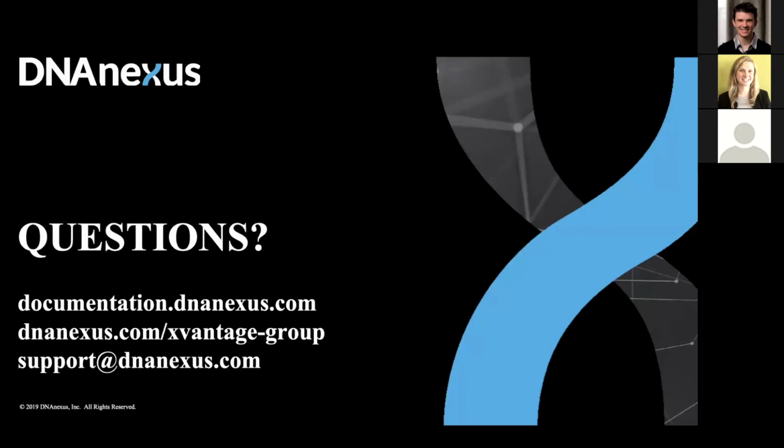Great question. So DNAnexus provides, or we provide you with the command line API. You can install that on either a Linux system or a Windows system or a Mac OS in my case. The actual CLI gives you the ability to stream data in a more programmatic fashion directly into DNAnexus.